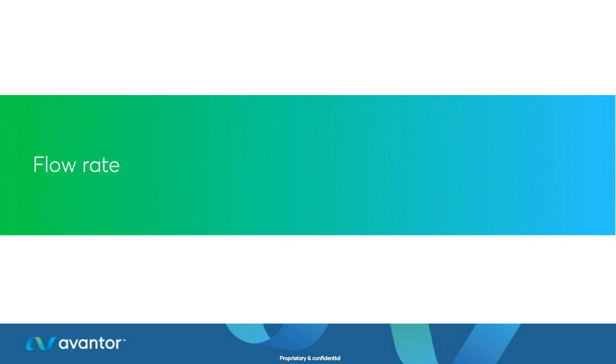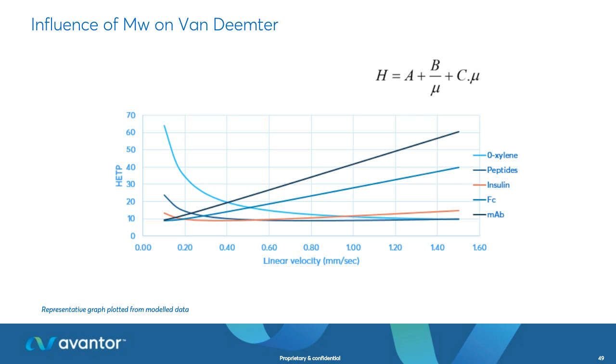You also need to look at the flow rate. So time's of the essence, obviously, and I've just seen the time on this webinar. So obviously we want to get things done as fast as possible, but when you're a protein, fast isn't always the best. So in this example here, we had to model it because it's very hard to get a true hydrophobic separation.